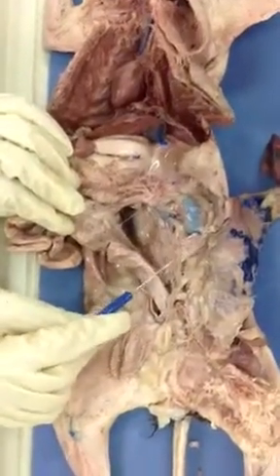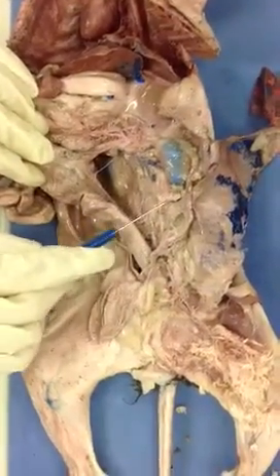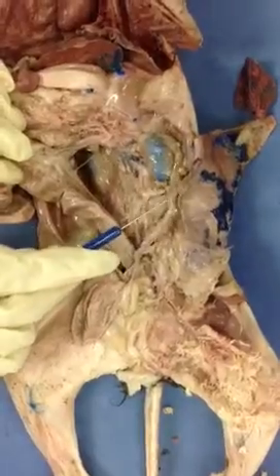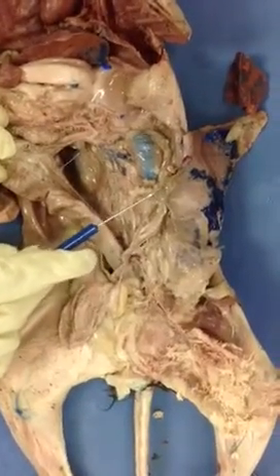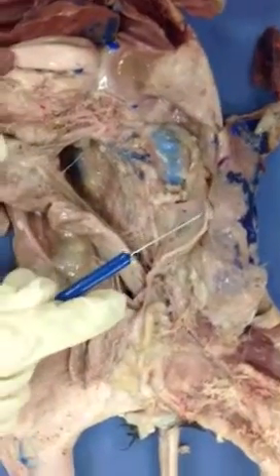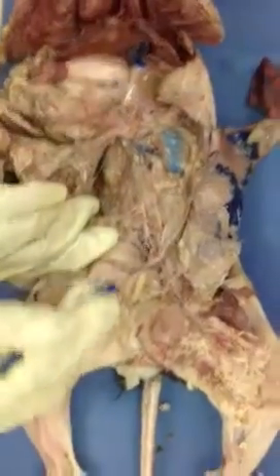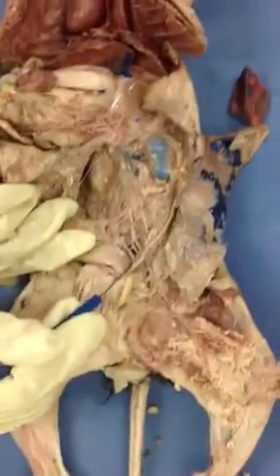I continue my journey, and I see that there's a blood vessel going here. You see it? So what is this blood vessel doing? Genital. The genital artery. Since it's a female, we're going to call it ovarian. Very good. Specimen for the male, right? It's spermatic. Yeah. Oh, spermatic.